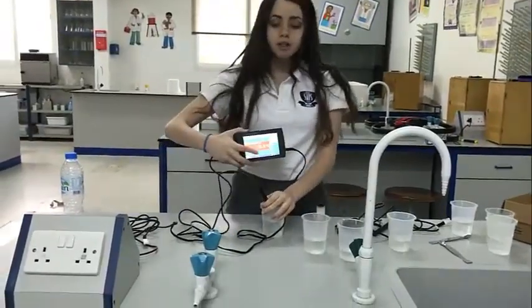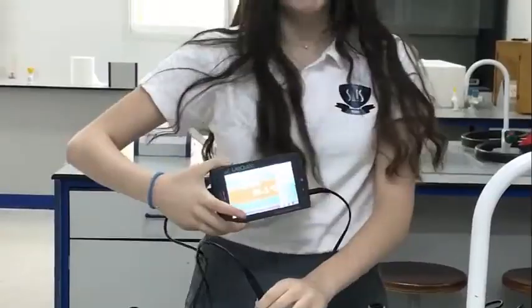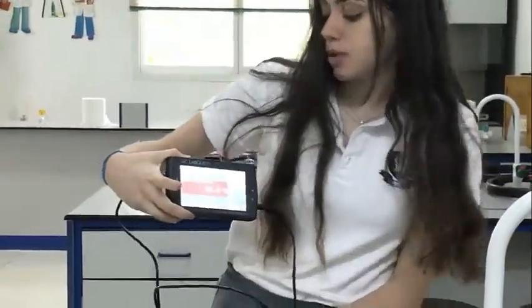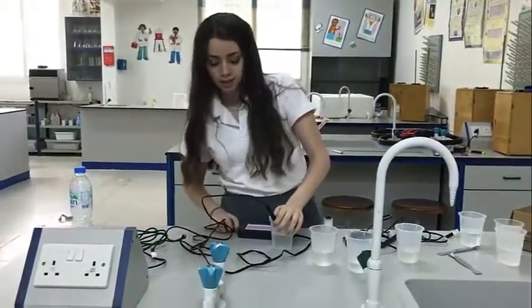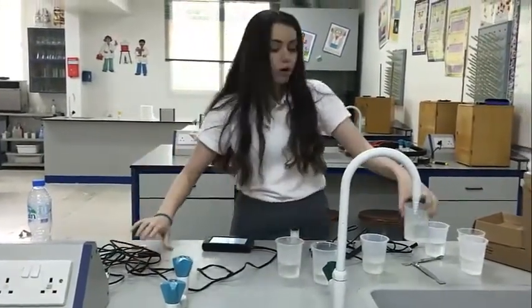The temperature is increasing, which means this one is the exothermic reaction and the other one was the endothermic reaction. So it's approximately 24.3 Celsius degrees. So that was for the temperature sensor. And now we'll move on to the next one, which is the conductivity sensor.